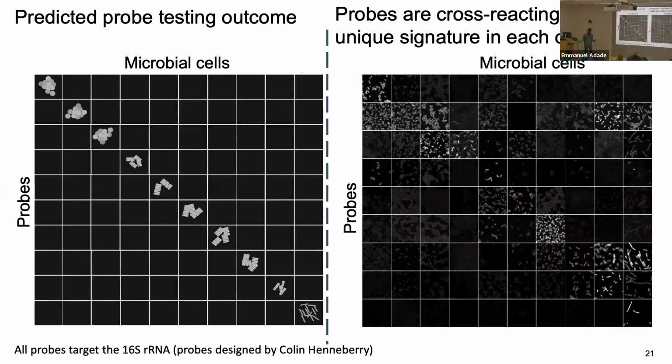Experimentally, that wasn't what we observed. We observed that even when we tried to design highly specific probes, the probes bound to their off targets. As a PhD student, this was one of the hardest moments for me, because I thought, this is a 2-week experiment, do this and we'll be good. And I did this after several months, and it was looking like that. We were stuck on that result, and it took us 2 years to figure out a way around this.